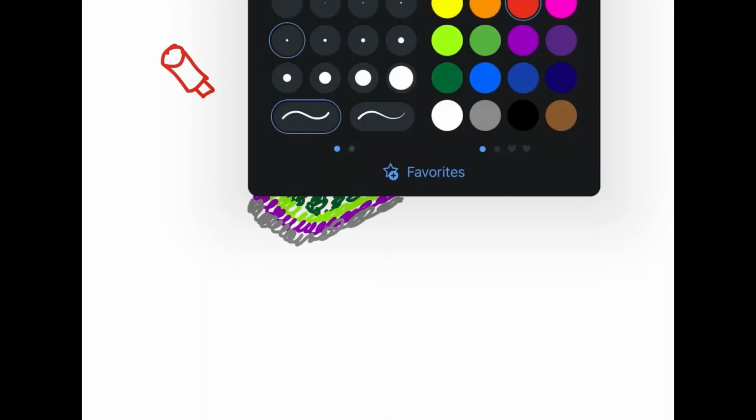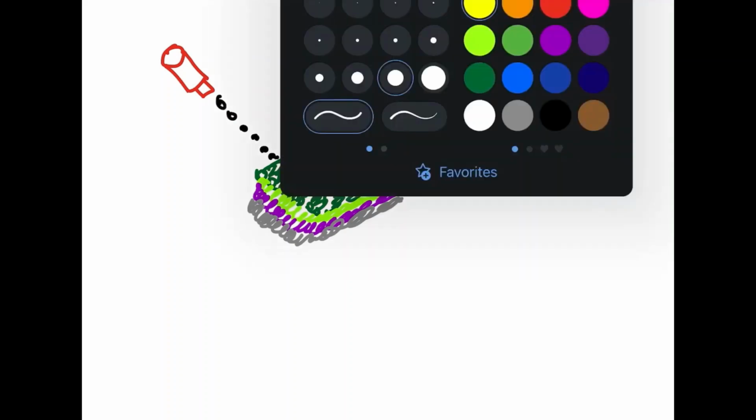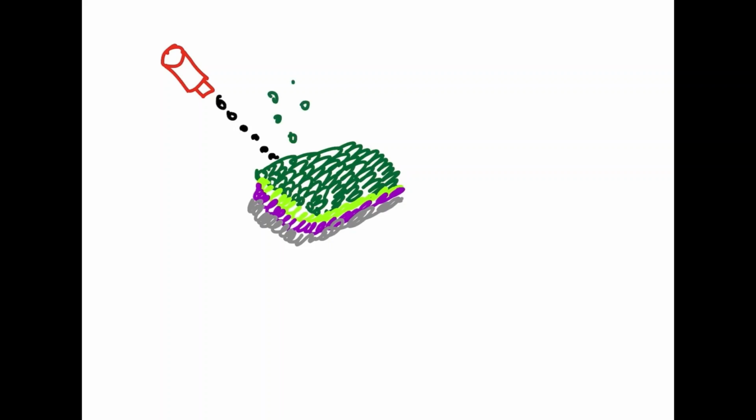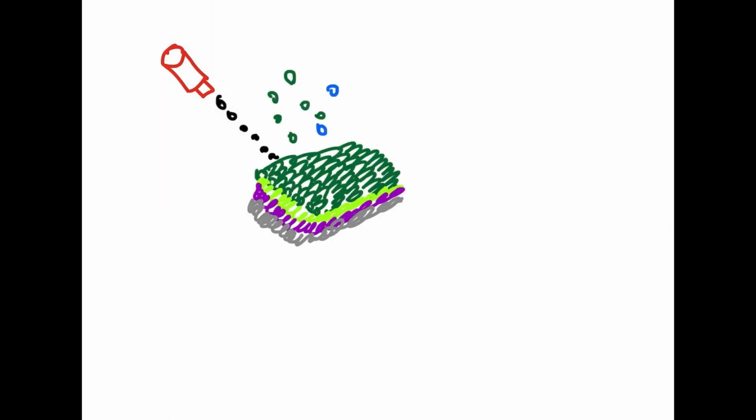So this is our sample showing the top few layers of atoms. Here we have high energy ion source with energy from 1 to 30 kilo electron volts directed onto a sample surface. The absorption of this energy by the top 50 angstrom of the sample results in the sputtering of neutral and charged species, positive and negative, from the surface. We see neutral atoms and atomic clusters and charged molecular fragments.